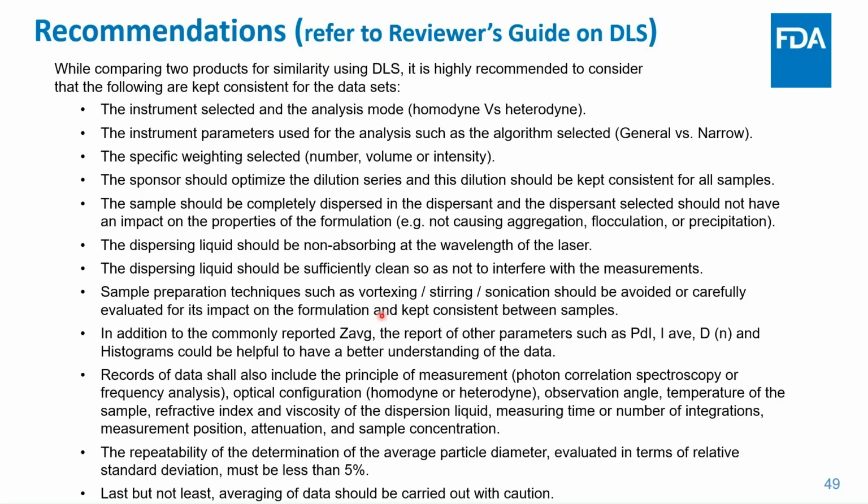Do things absorb at that wavelength? What's the dispersant? What are the concentrations? What type of optical configuration are they using? What's the viscosity? Measurement position, attenuation, sample concentration. So this just goes back through everything we just talked about. It's a short list for you guys for your recollection in the future.